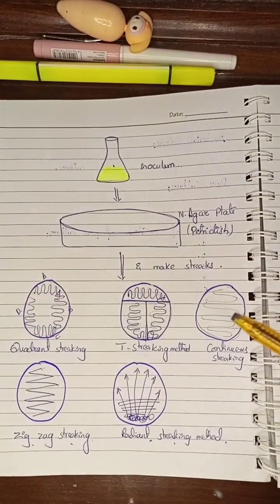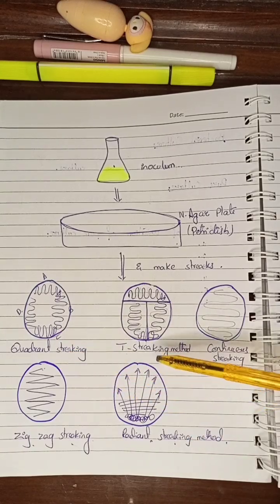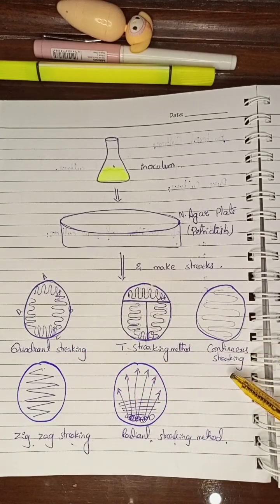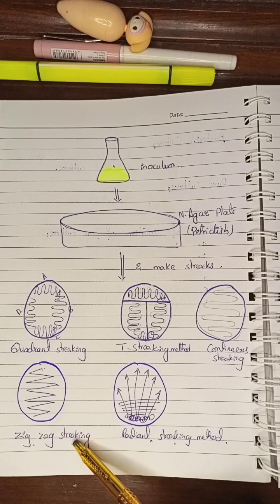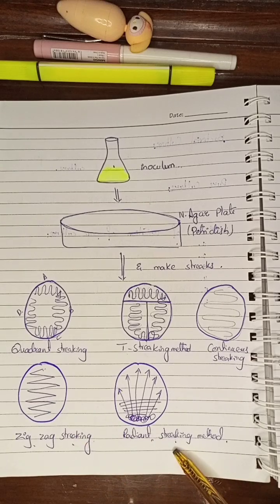We can also make other types of streaks like T streaking method, continuous streaking, zigzag streaking method, and radiant streaking method.